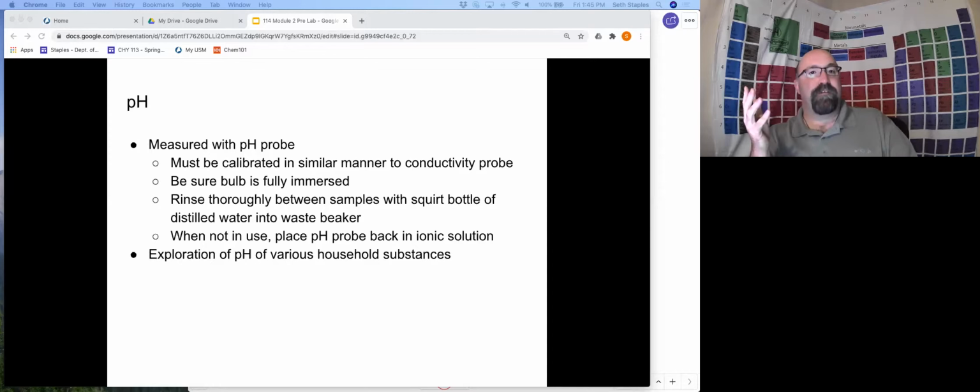You're going to do a couple of different explorations with pH. You're going to explore the pH of some various household substances. You're also going to explore the effect of a buffer on a water system. Now, this is one that, honestly, this semester, recording this for fall 2020, we're not going to have time to do in lab. And if I reuse the same video for spring 2021, same thing. We're not going to actually be able to explore this titration, or this buffer, in the lab, but you're going to receive some data for it.